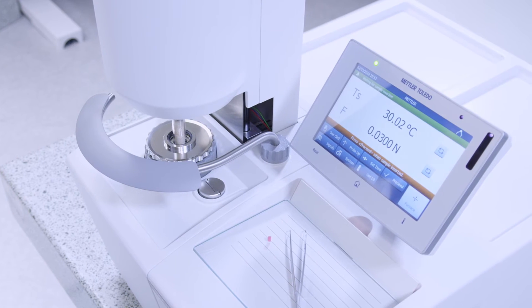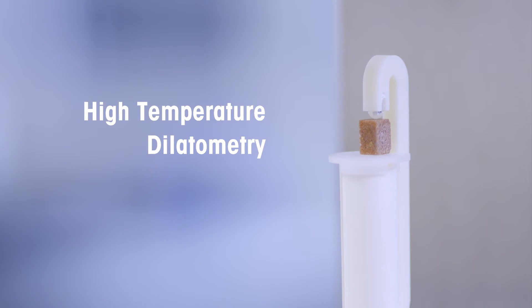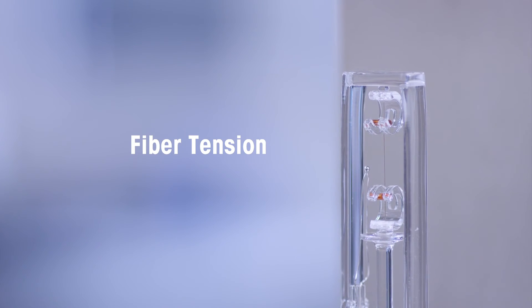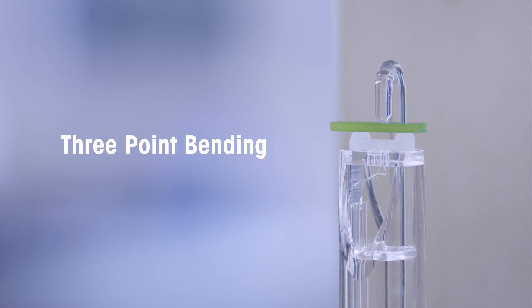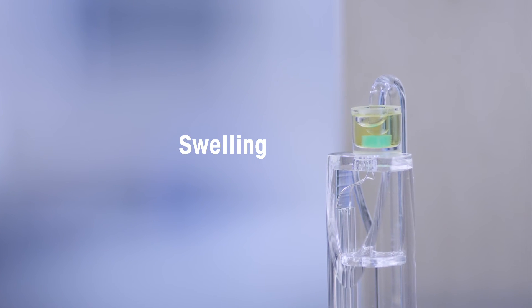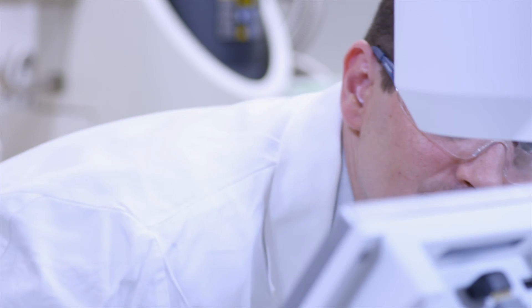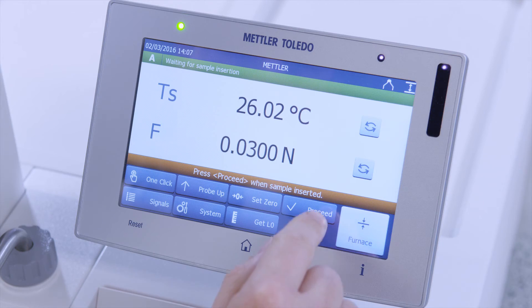Like all thermal analysis excellence premium line instruments, the TMA-SDTA2 Plus is based on a modular concept. It enables the user to measure samples in different deformation modes. The exchange of sample holders can be performed quickly and easily, and pre-defined measuring methods can be started with one click.